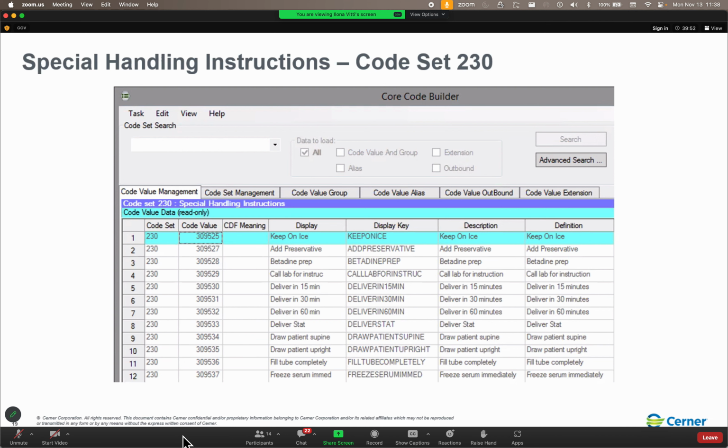See, remember, the site prefixes are based on where the patient is registered. Okay. So it's not about resource routing. It's where is the encounter taking place. Okay. So yeah, because when they're registered for phlebotomy, it's registered as a Quest encounter. Right. So if we go back to slide 14, and we'll get this information, this will go ahead and pop up again. In the location tool, like for model hospital, we assign it a site prefix. So it's whatever the facility is from the patient care hierarchy where that patient encounter takes place. Okay.